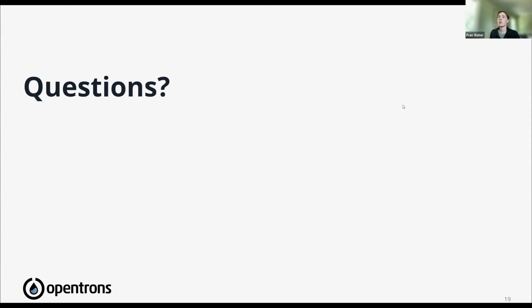There's one more question that's just coming in from Kamesh. Is there a need to be wary of prompt injection and its impact on automation? Absolutely. The quality of the prompt and the quality of the data that you provide for the model to train will heavily impact how close you are to providing a running, simulating, optimal protocol. So absolutely.